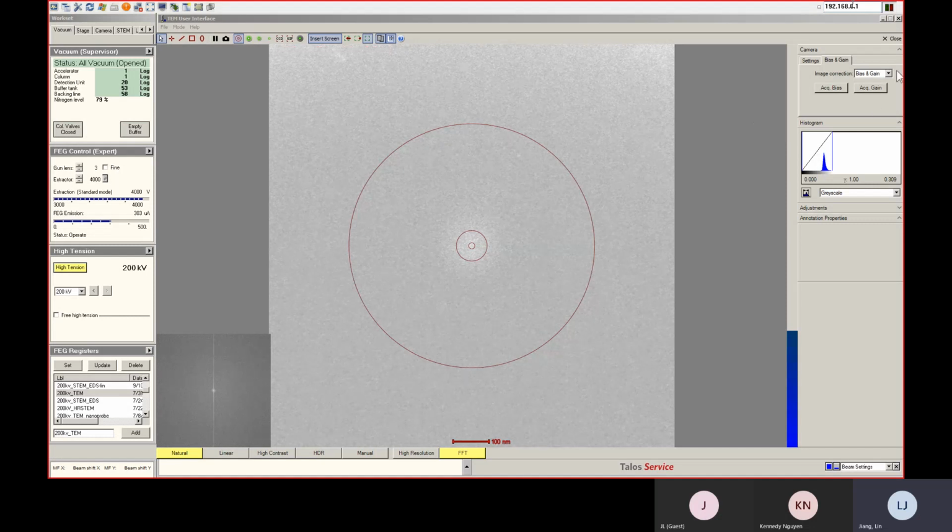And now you can choose bias again. This is easy. So you can request control. You can take a look and practice right now. I think you already have control, right? Yeah. Okay. Let's first do the bias first. You should always take the bias first.